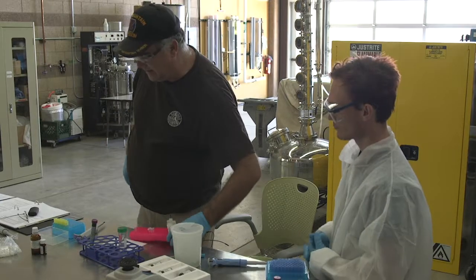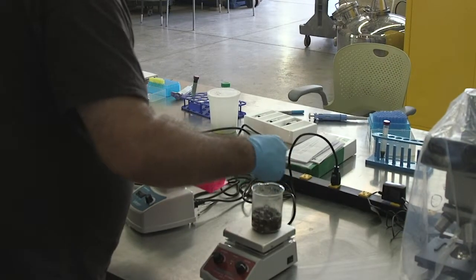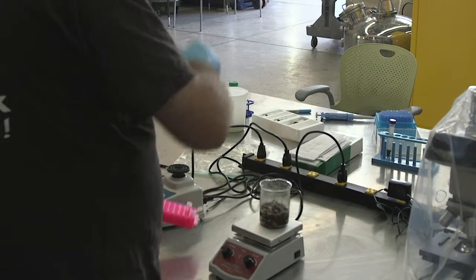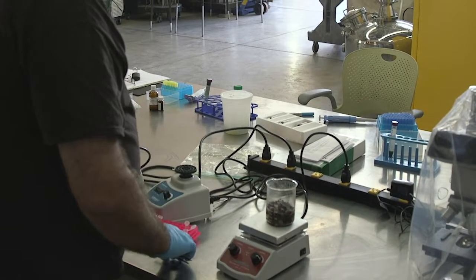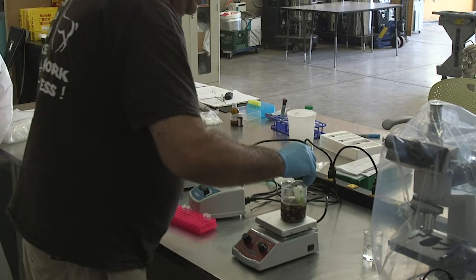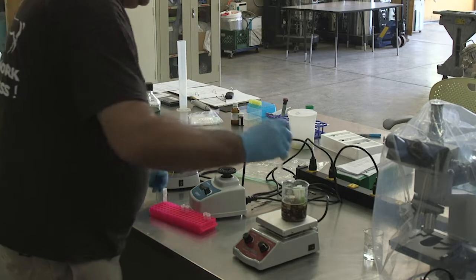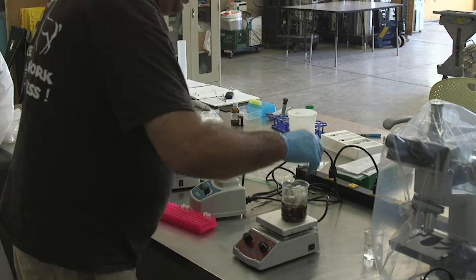Now these go back into the boiling water for 12 minutes. We take them out and vortex them about every 4 minutes or so — we'll take them back out and mix them up some more. So now we're trying to digest. Let these go for 12 minutes, boil away.